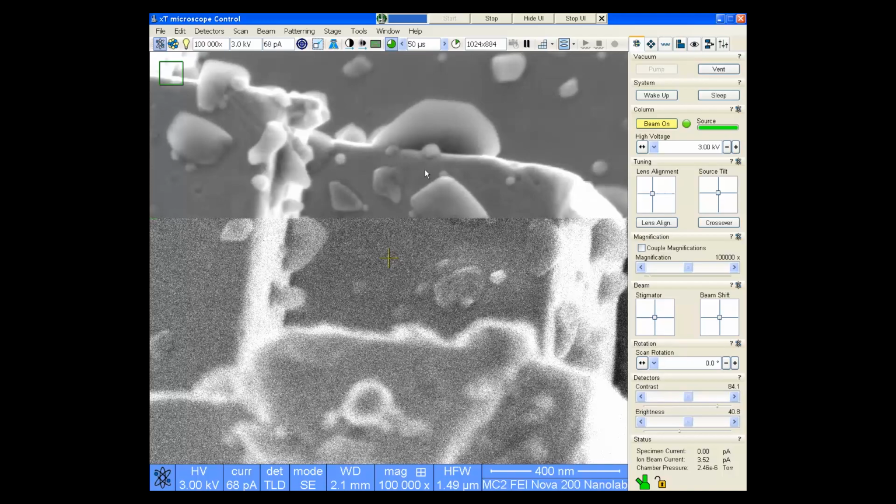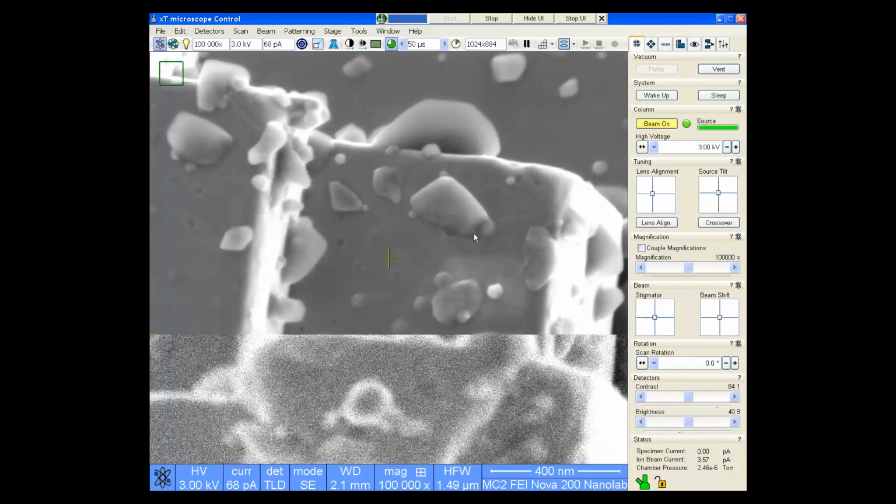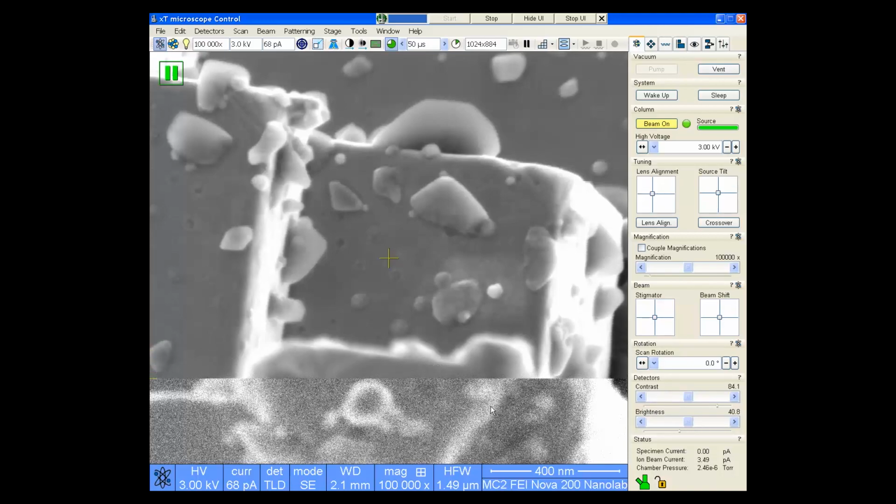So these really high resolution conditions when you're close to the lens are better served with flat samples than bumpy samples. But this looks pretty nice. I'm not going to sit and wait for this to finish all the way, but again, you can see this feature down here on the bottom of the screen is quite out of focus, even though the middle is in focus.